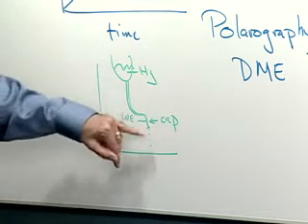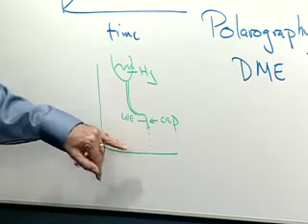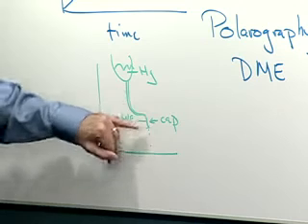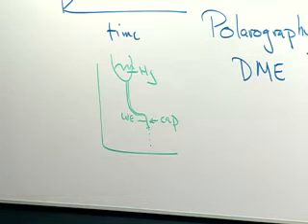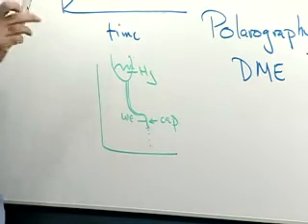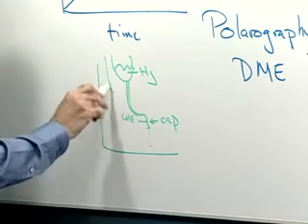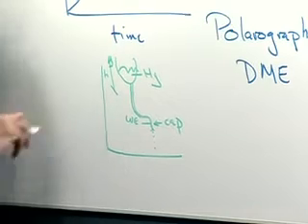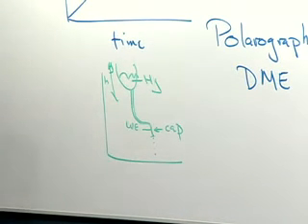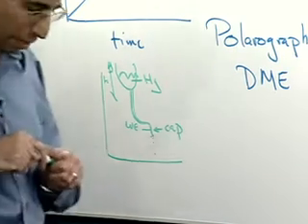And the rate that these drops drop out of that capillary and the size of those drops depends on several features. One is the diameter of the capillary, but the variable one, the one that you control during the experiment, is the height of this reservoir. And as you raise that up and lower it, you change the drop time. And that's, of course, how Heyrovsky did that.